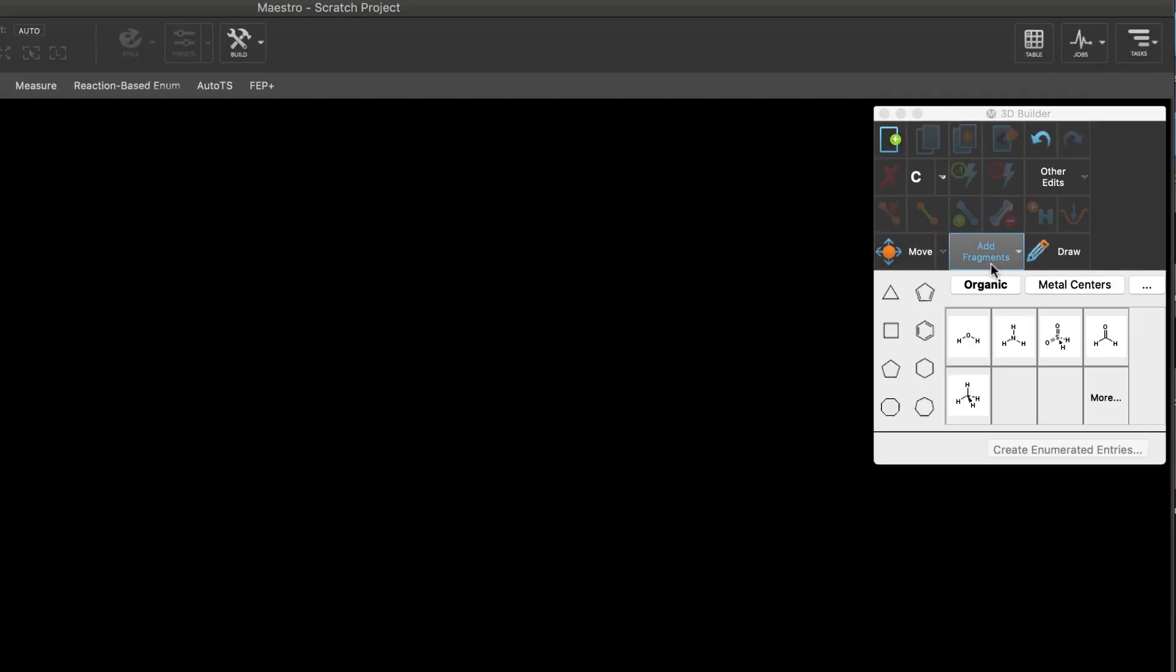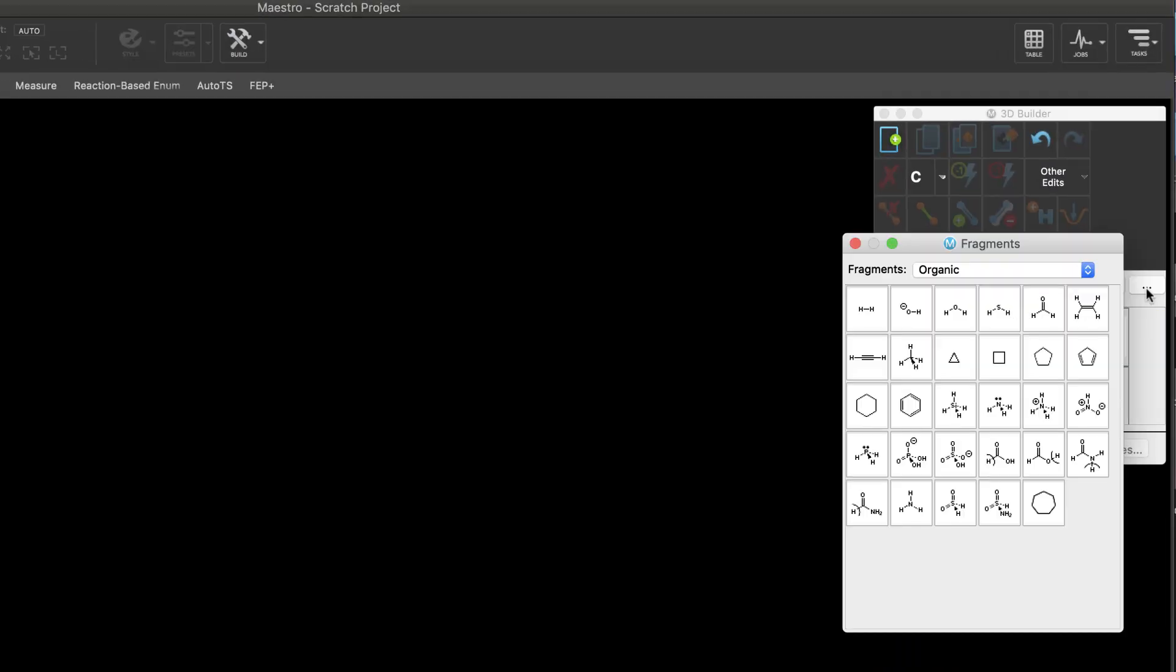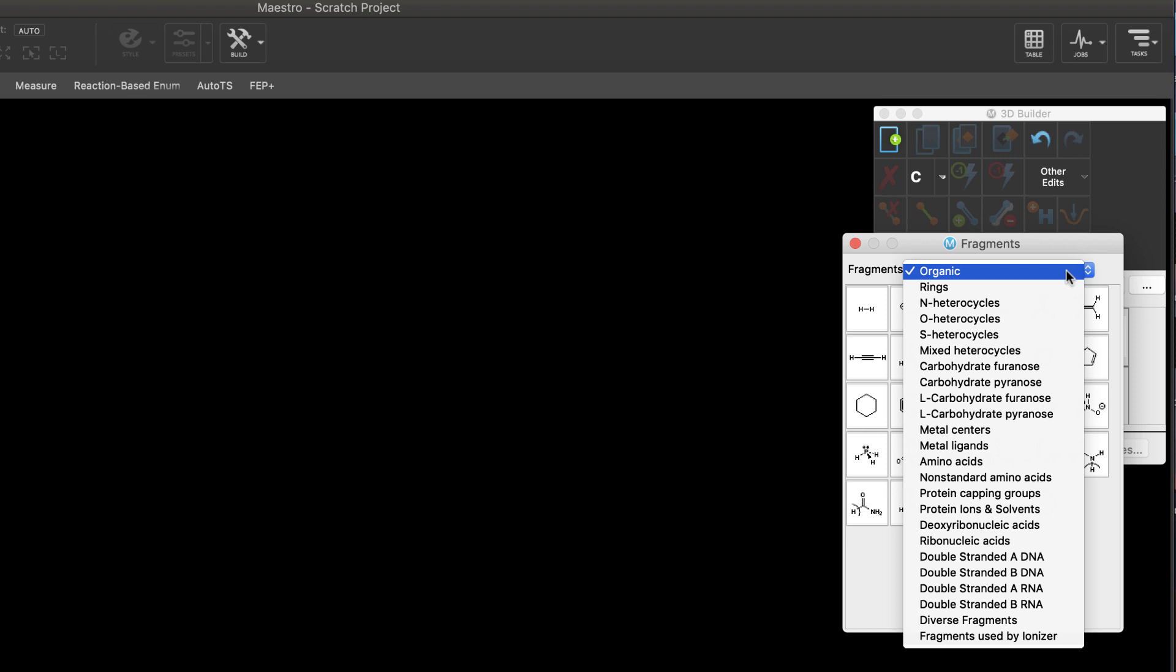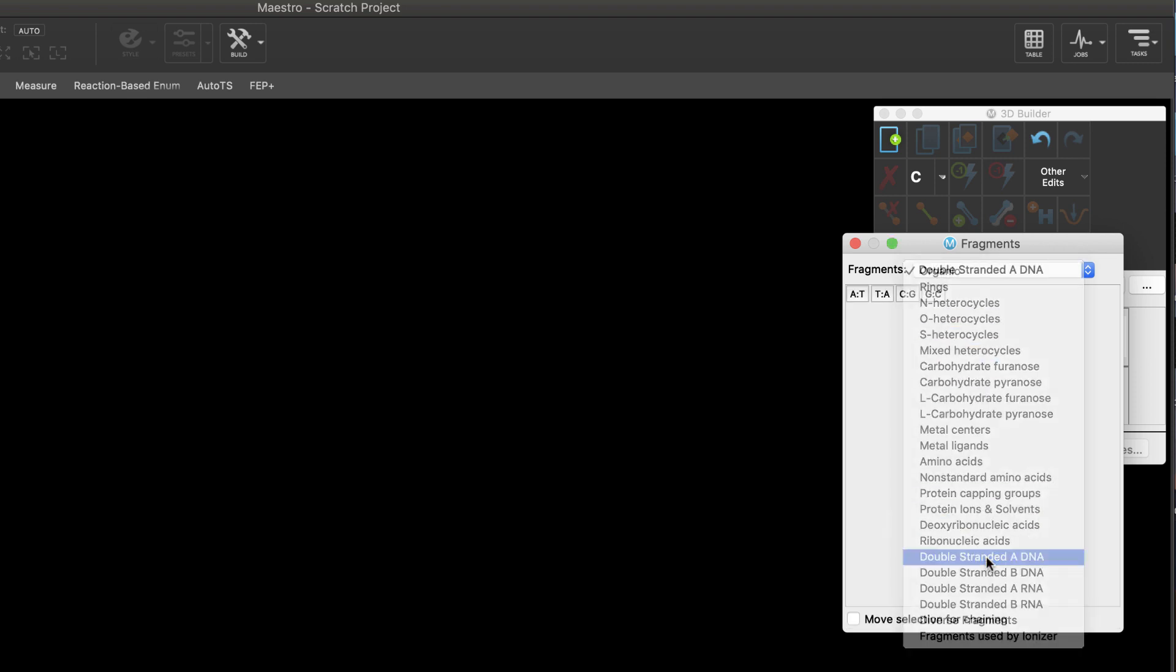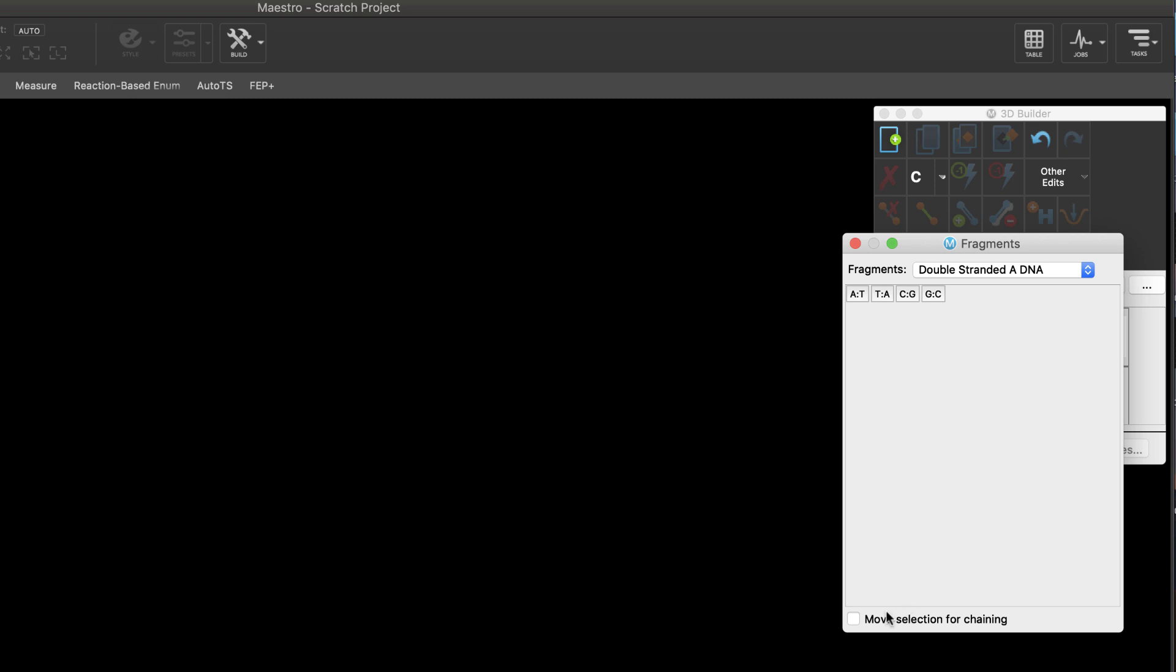Maestro's 3D builder has expanded its building capability for DNA-RNA and non-standard amino acids. It's now possible to quickly build these biopolymers with chaining.